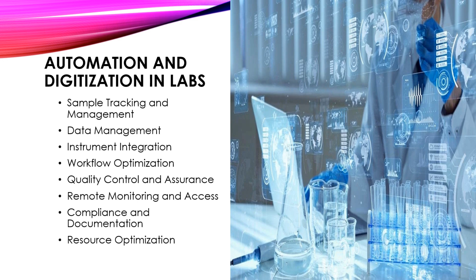Quality control and assurance. Automation enhances quality control and assurance by enforcing standardized processes and minimizing human error. Automated alerts and notifications help identify deviations from predefined protocols, ensuring compliance with regulatory requirements.